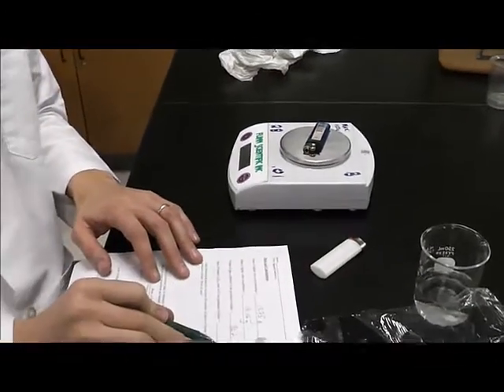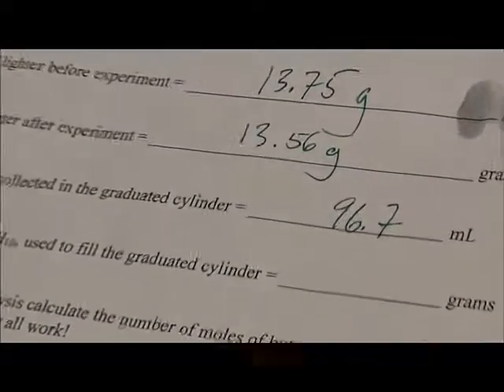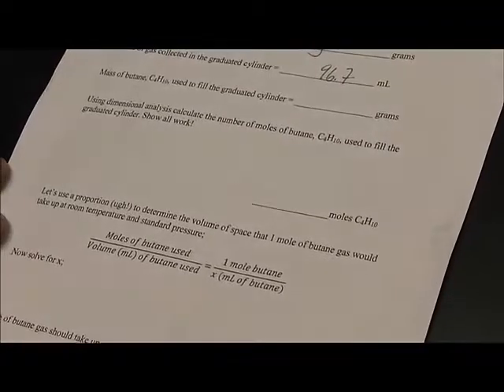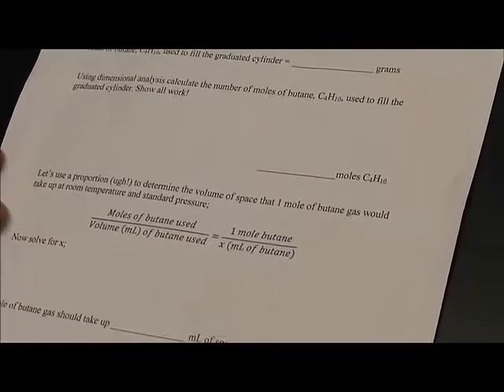You can calculate how many grams of butane you used based off of that. You can do some dimensional analysis to figure out the number of moles of butane. Then do some proportional math, and you'll find out how much space a mole of butane would take up.